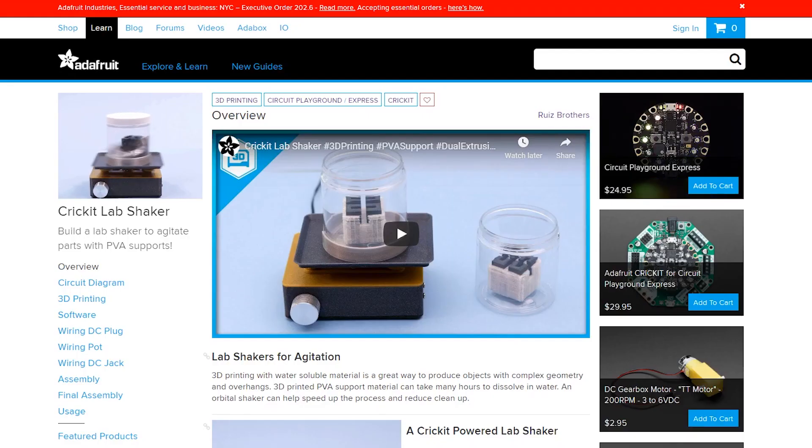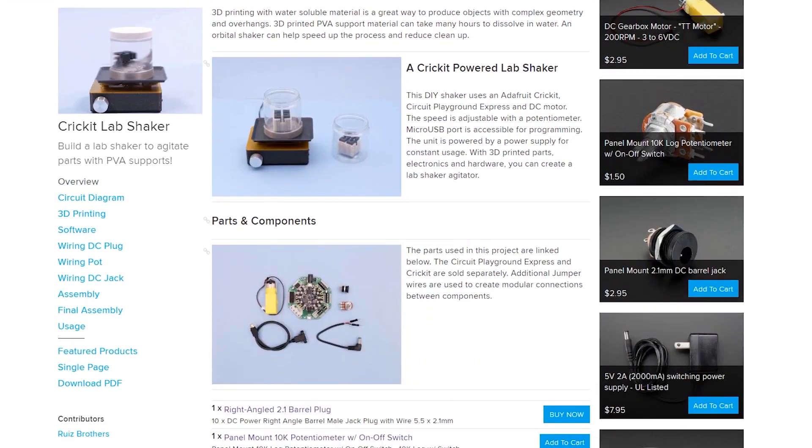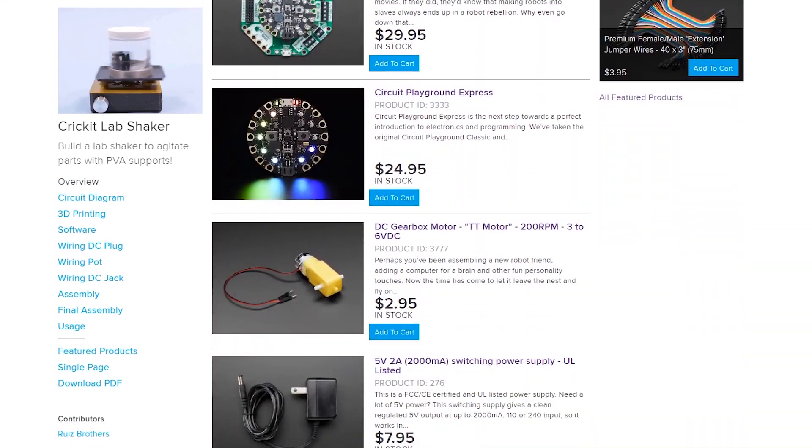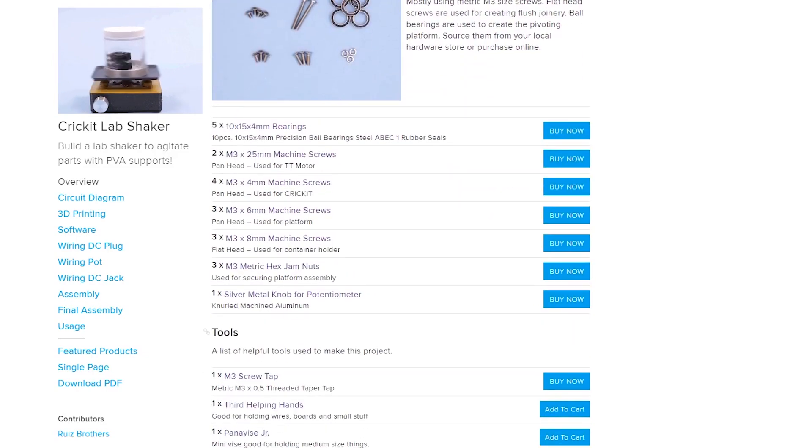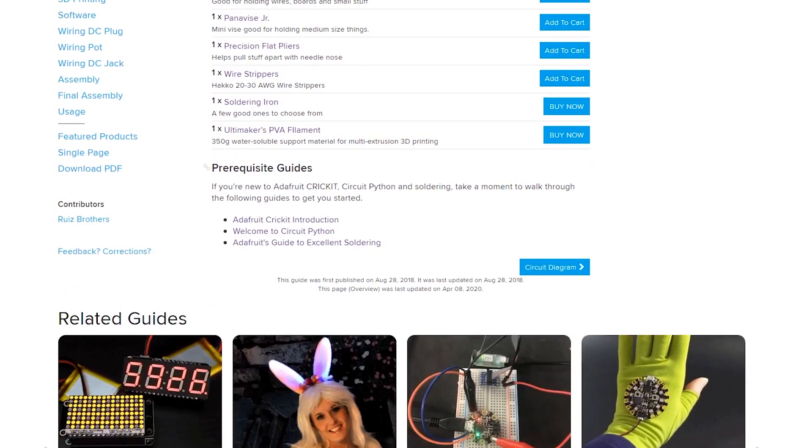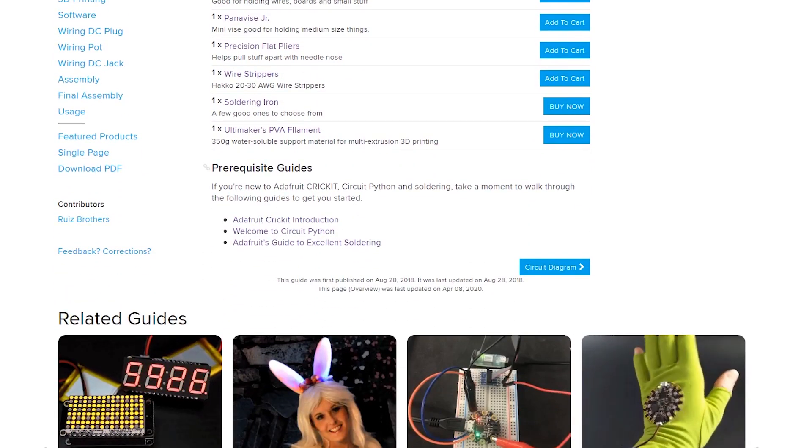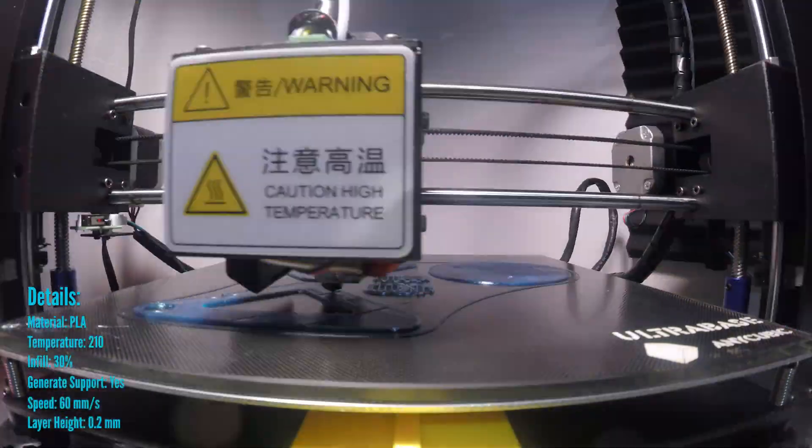To get started, I went to learn.adafruit.com and checked out Noe and Pedro's full tutorial. They have a full parts list. You can order all the parts you need with just a click, so I advise anybody go check that out first.